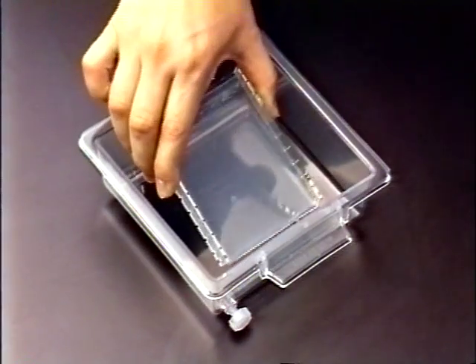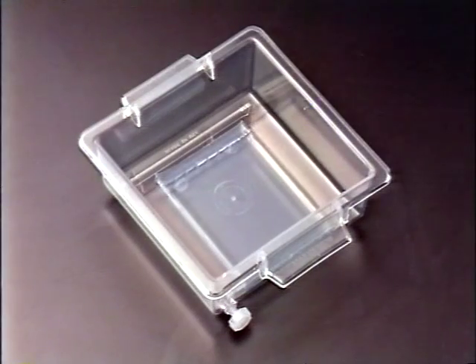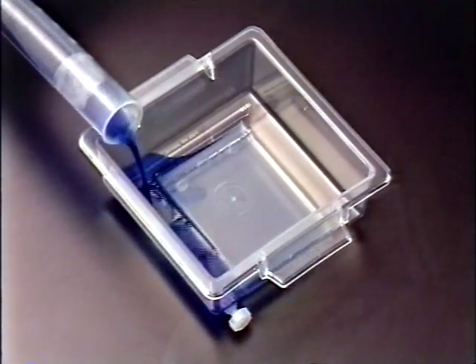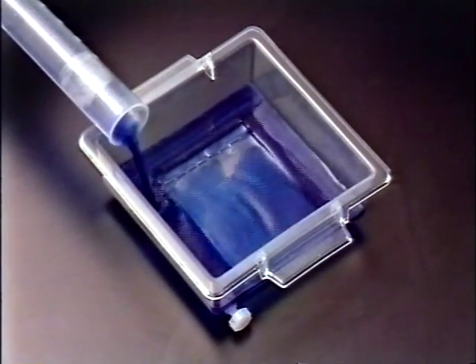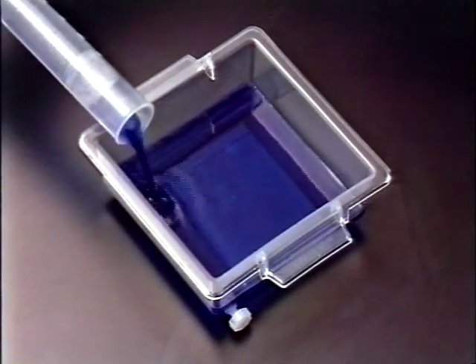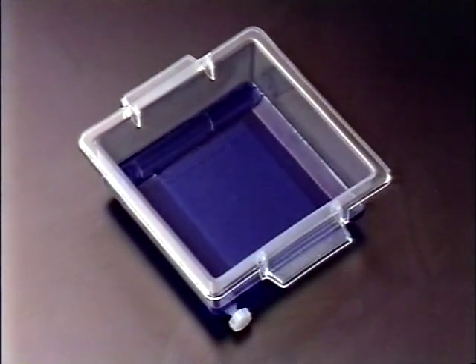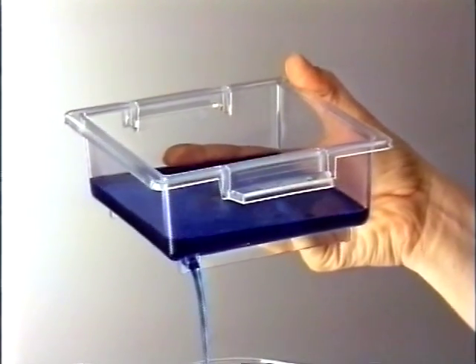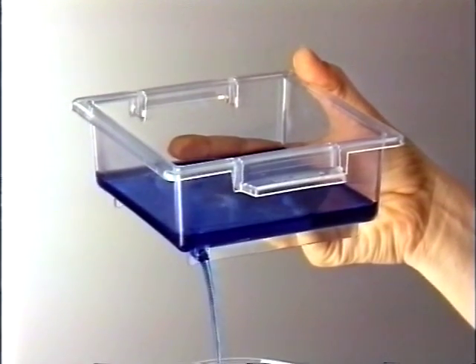Carefully place the gel in a staining tray. Pour approximately 100 milliliters of stain into the staining tray so that the stain covers the gel. Allow the gel to stain for 20 to 30 minutes. Carefully decant the used stain. Make sure the gel remains flat and does not move up against the sides of the staining tray.